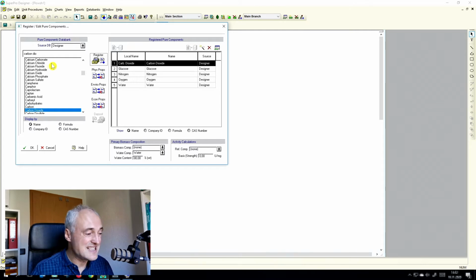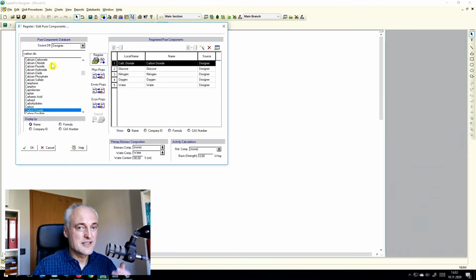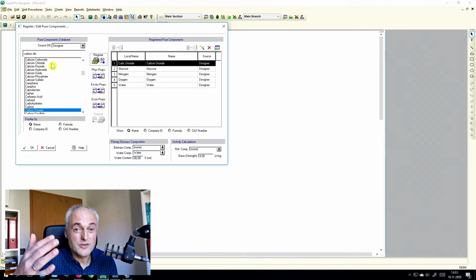And we have distiller soluble. Distiller soluble is of course not a substance; it is a mixture. So the question is how to register a mixture. It is composed of several components, and we talked in industrial biotechnology a couple of minutes ago that this is complex.